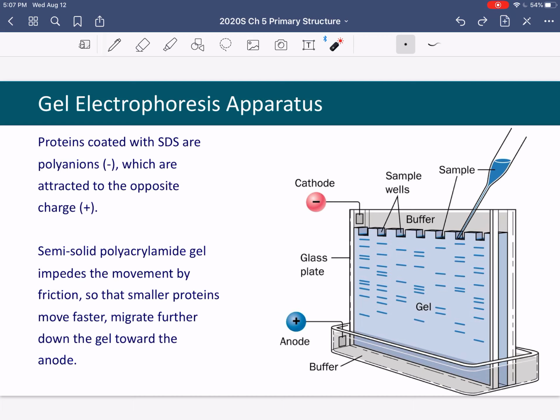And vice versa for the cathode. Only the cations love the cathode, and none of our samples are cations, so they all travel this way. Now, if you switch your leads and you hook it up backwards, your sample will go upwards and won't separate. So all of us do that once and then never again.